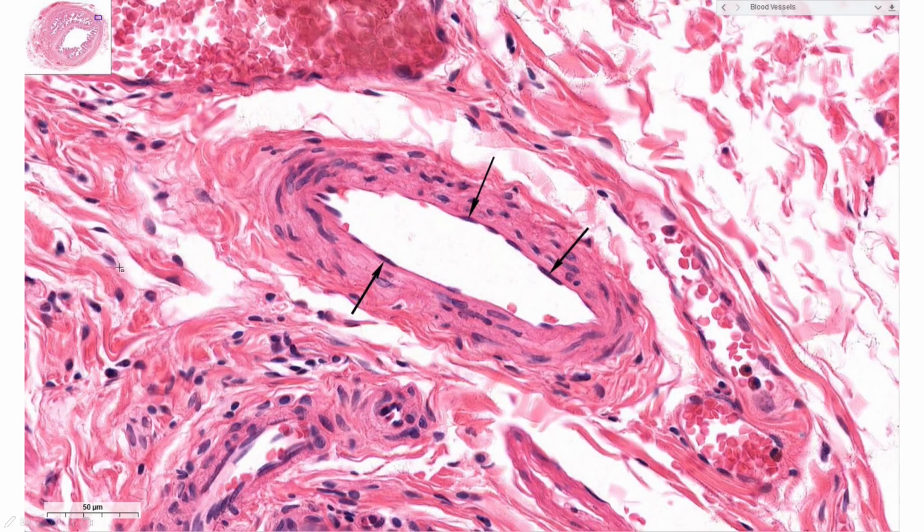Here is our blood vessel. Blood vessels are lined with a simple squamous epithelium. This layer is our single layer of simple squamous cells. The arrows are pointing to the nuclei of a few of the simple squamous cells. Don't be confused by this other tissue surrounding the vessel. This is smooth muscle. Smooth muscle is a tissue we will look at later.